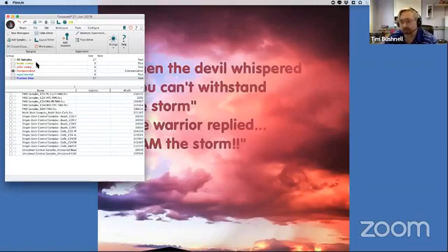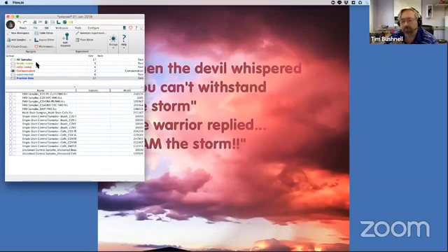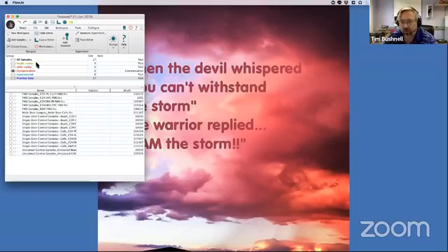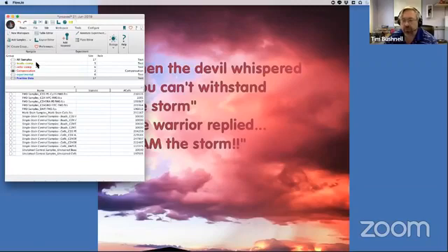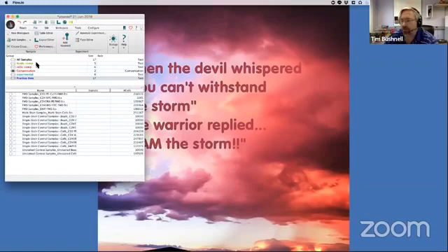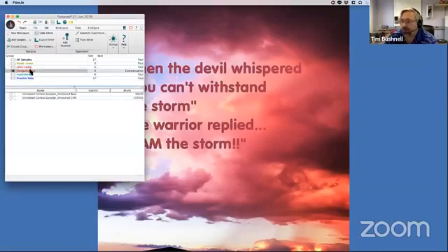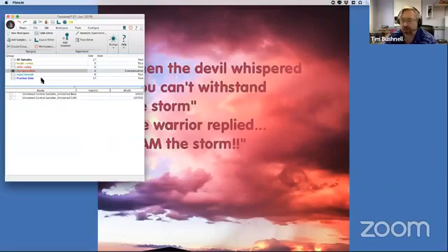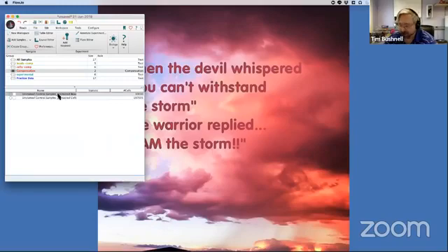Now, if I were to run this on Indiva, I could compensate on my instrument if I wanted to, but I like to compensate in my third-party software, like FlowJo or FCS Express, because I feel I have more control there. Both packages, in fact all the major third-party analysis packages, have some sort of compensation wizard. Now, in FlowJo here, you can see that it's created a group called Compensation, and it attempts to automatically put in tubes that have comp or compensation in their name into this file.